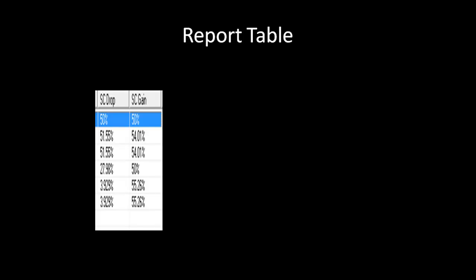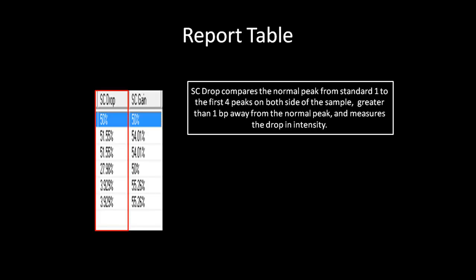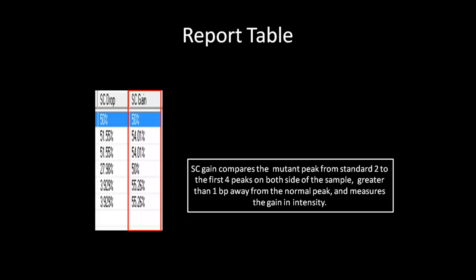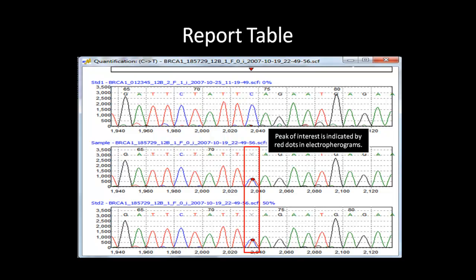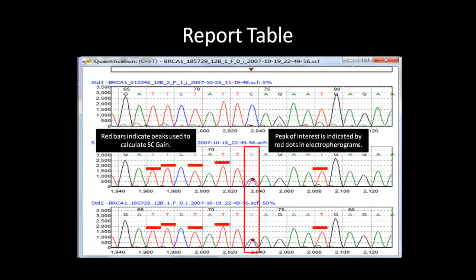The SE drop and SE gain stand for single color drop and single color gain. The SE drop measures the drop in peak intensity by comparing the normal peak from standard 1 to the first 4 peaks on both sides of the sample greater than 1 base pair away from the normal peak of the same wavelength. The SE gain is calculated the same way as the SE drop, except it uses standard 2 to measure the mutant peak gain in intensity. You can double-click on any of the variants to bring up the electropherogram of the position of interest. The position of interest is indicated by a red dot on top of the mutation peak. The peaks with the red bar indicate the mutant peaks used to calculate the SE gain. You can therefore review all your quantified substitutions with ease.